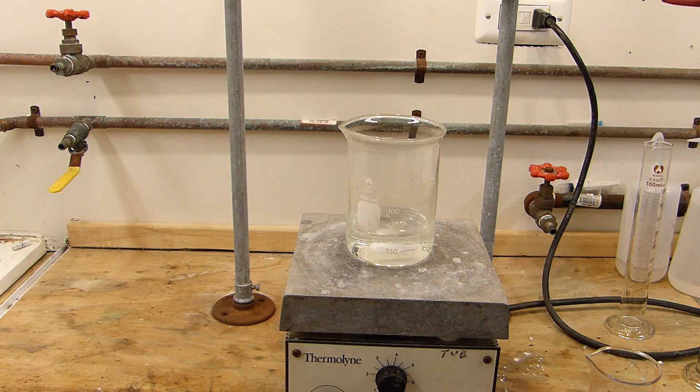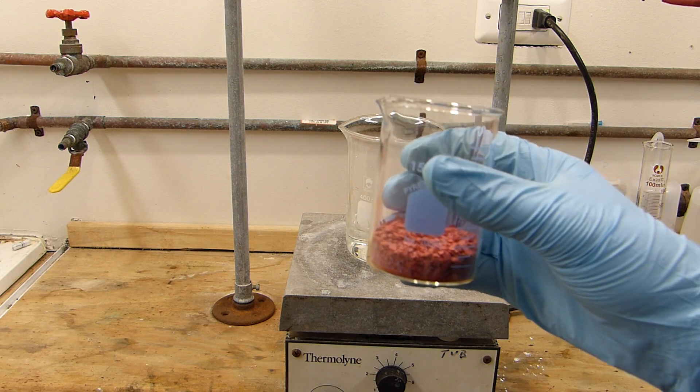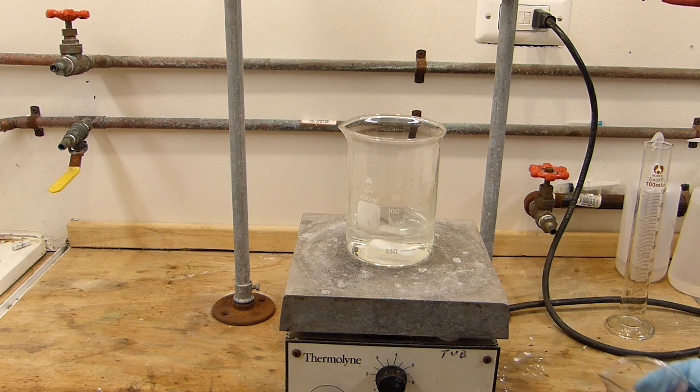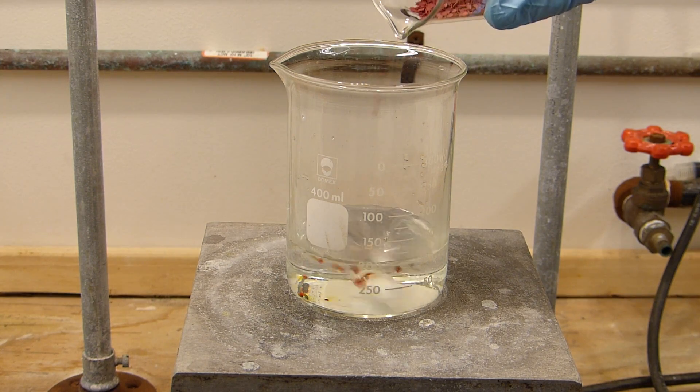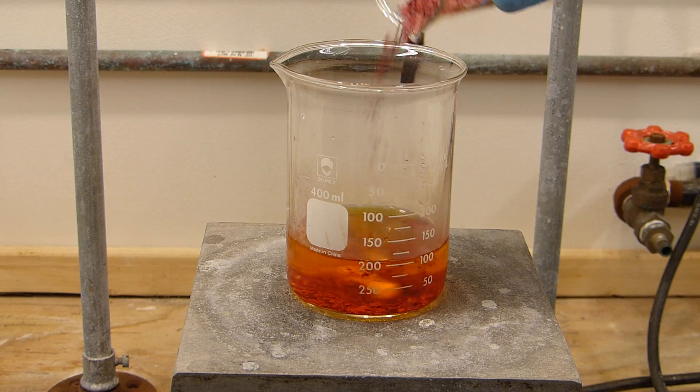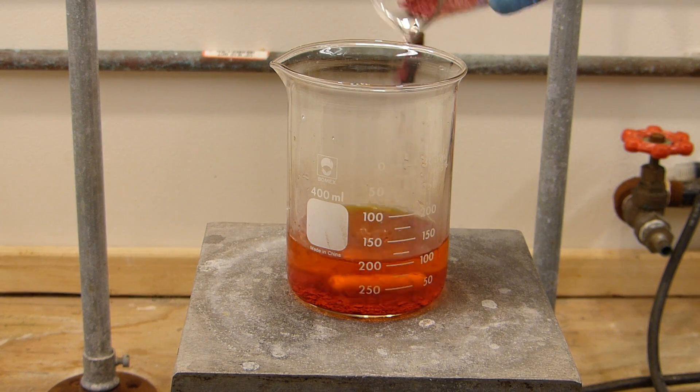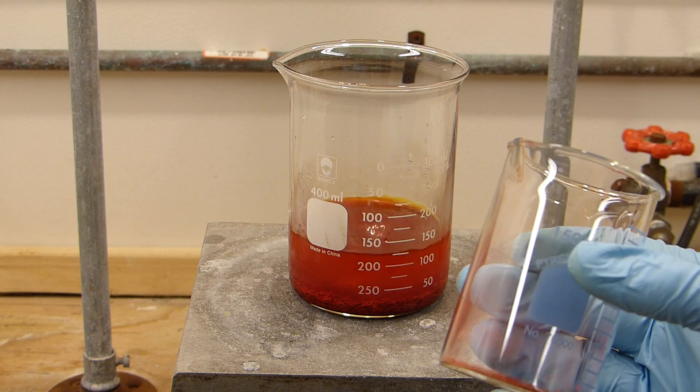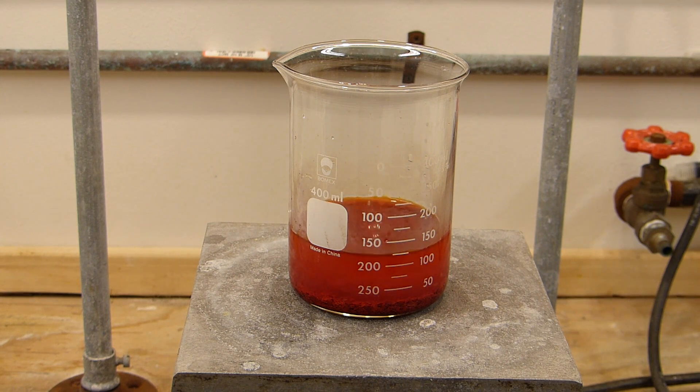Speed up the stirring a little bit and now I'm going to slowly add the chromium trioxide flakes. There we go. And I'll let that stir for a little while to make sure everything's completely dissolved.